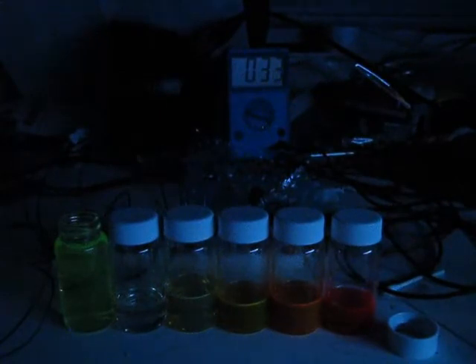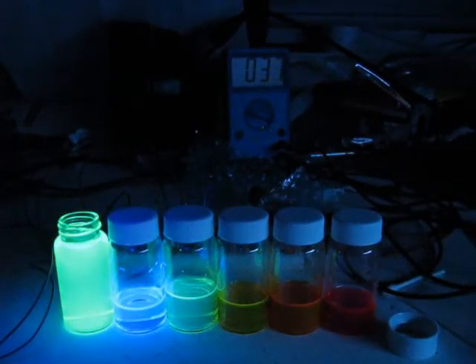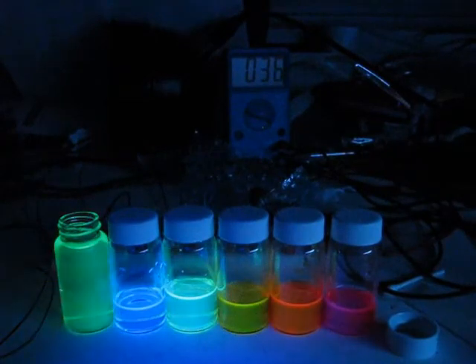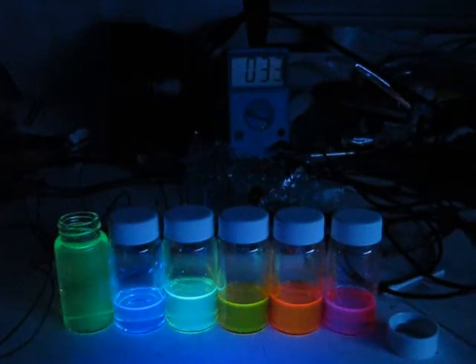Here are some very pretty UV-active dyes. That's essentially highlighter ink on the far left, and we have some various anthracene or polyaromatic-based dyes here on the right.